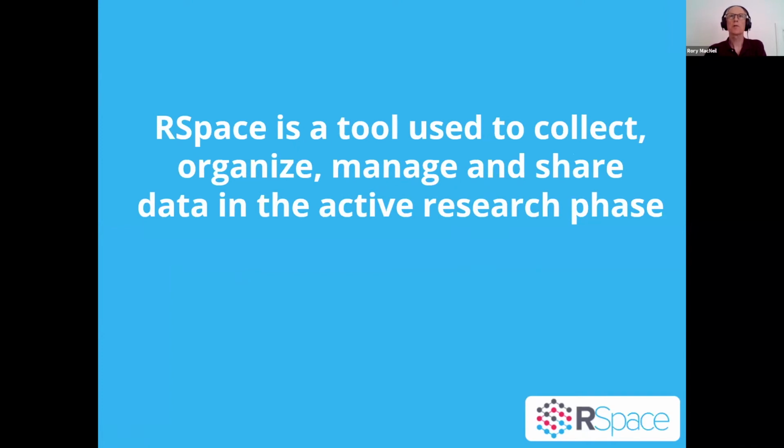So RSpace is an ELN, or an electronic research notebook, which is a growing term, that's used to collect, organize, manage, and share data during the active research phase.